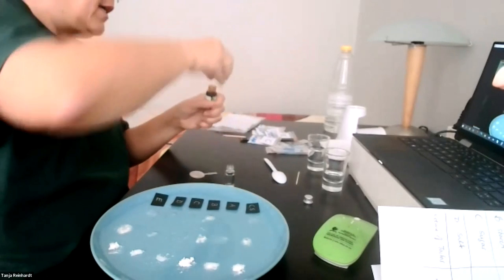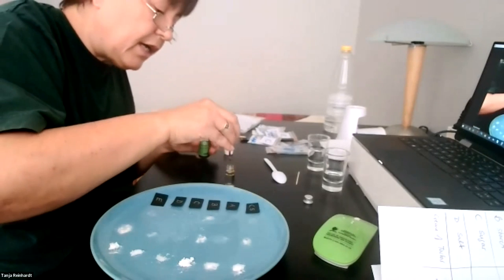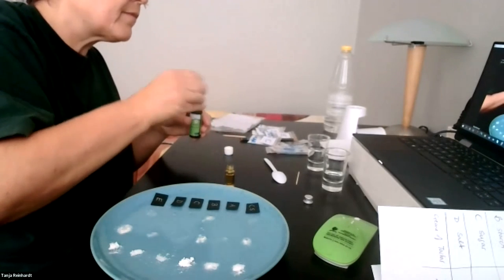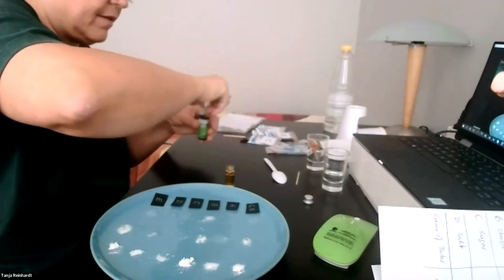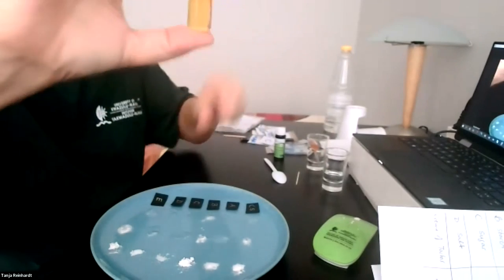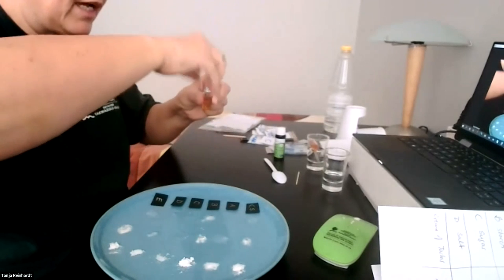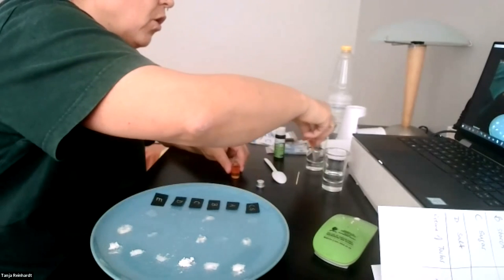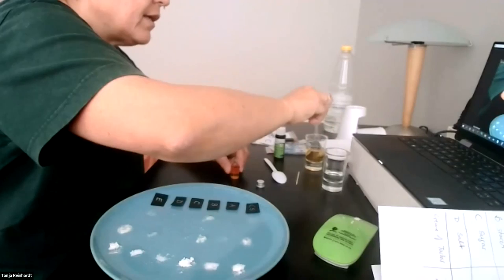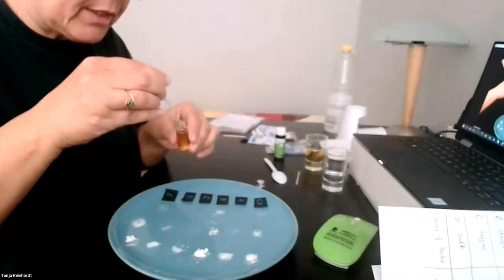And I'm going to take some iodine and I'm just adding 1, 2, maybe 3 drops in it. Okay, so that just gives it a light color here. Can you see? It's just a tiny light color. So just to lighten up the color of the iodine. So this is what we are basically making, a solution. Okay, so I'm gonna use my syringe and let's just check out what's going to happen.